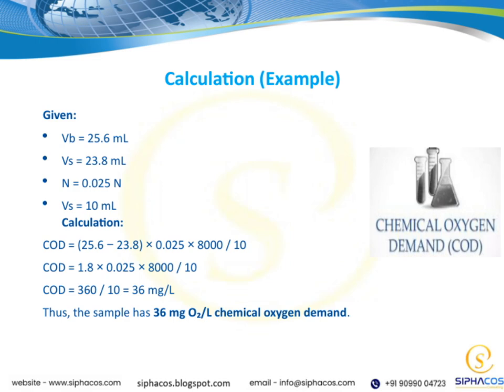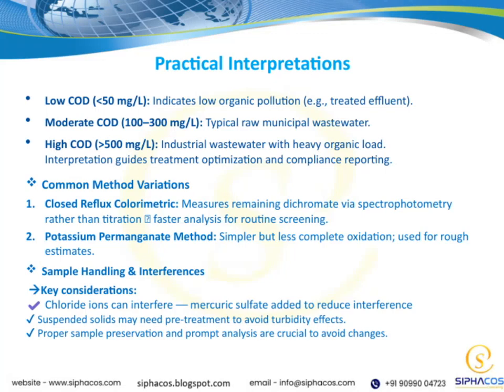This example really highlights how we quantify organic pollution in water samples, which ties into our overall theme of assessing water quality. Now, let's look at some practical interpretations of COD levels.